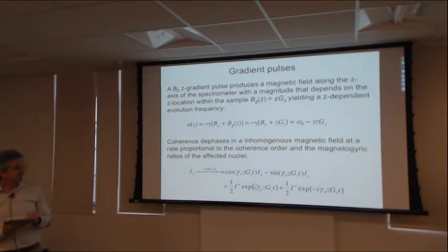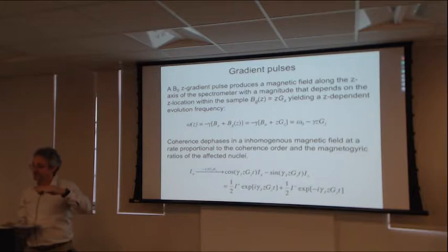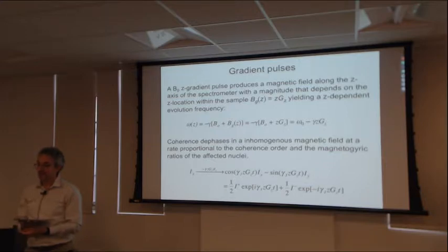these phase factors as a function of z will vary over all possible angles, possibly many times 2 pi, but certainly 2 pi. So if we end up averaging the signal over phase factors that cover all angles between 0 and 2 pi, then that signal will be 0.